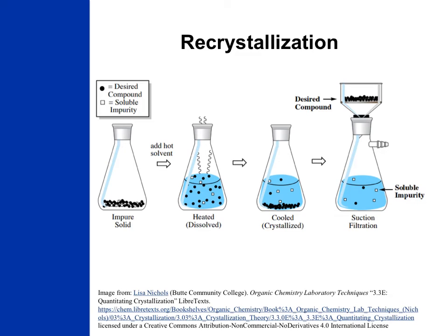But as that solvent cools, our sample will begin to recrystallize, form a precipitate, come out of solution. What we are worried about today are the soluble impurities, so we're going to cool this sample very, very slowly. Once we've cooled it, our desired product will precipitate out, and because it's precipitating out slowly, it will become more pure. The impurities will stay in the solution because they were soluble in that solvent.